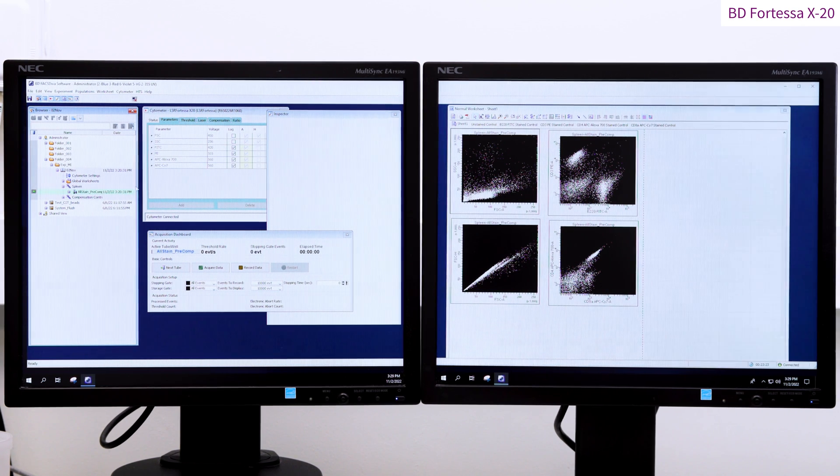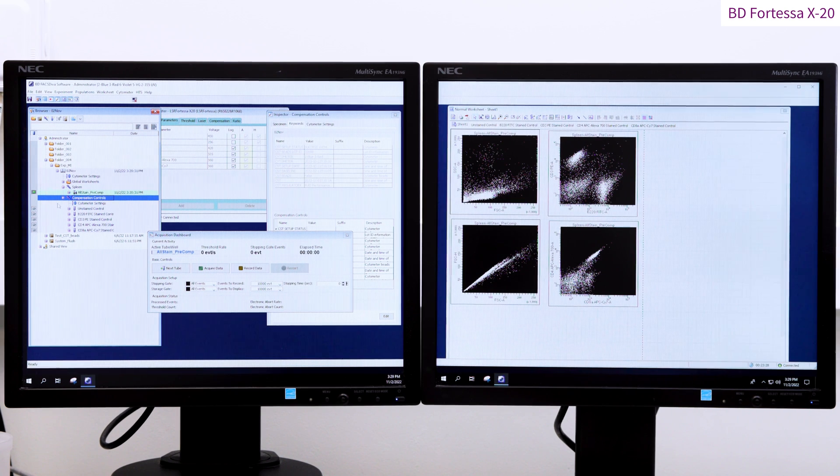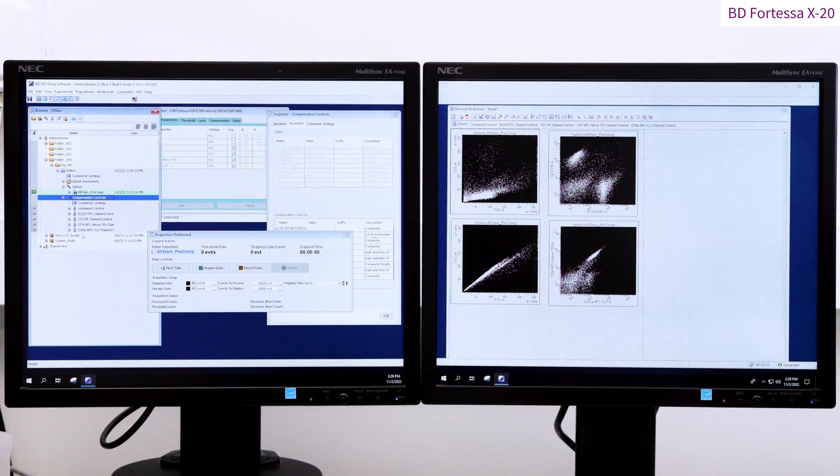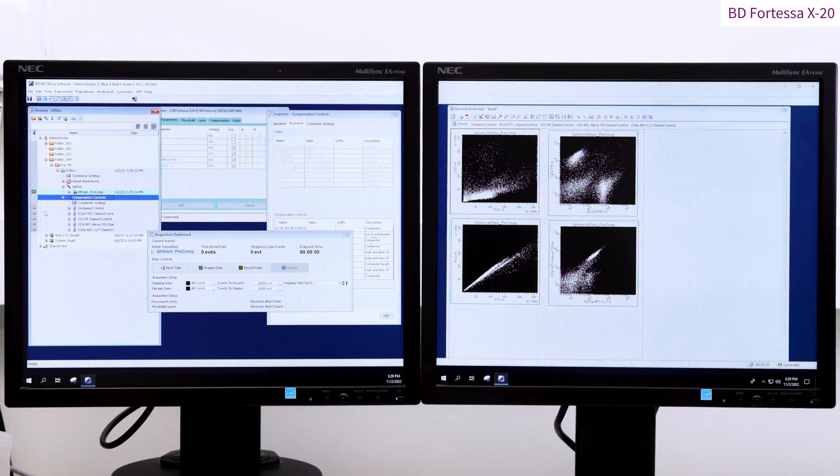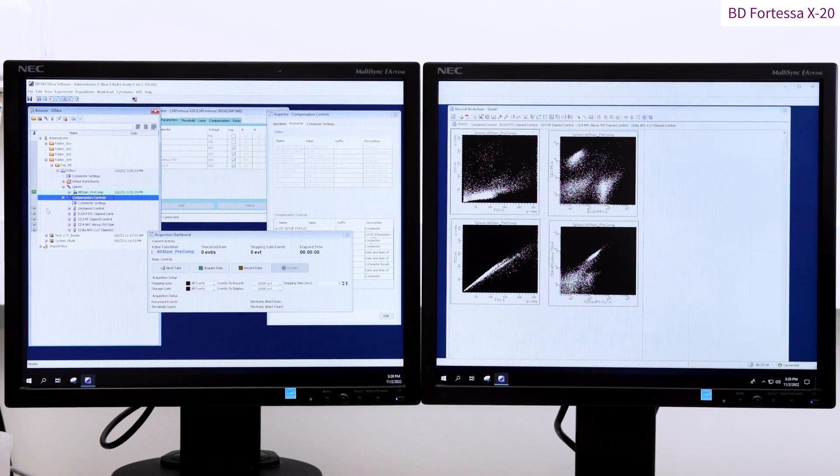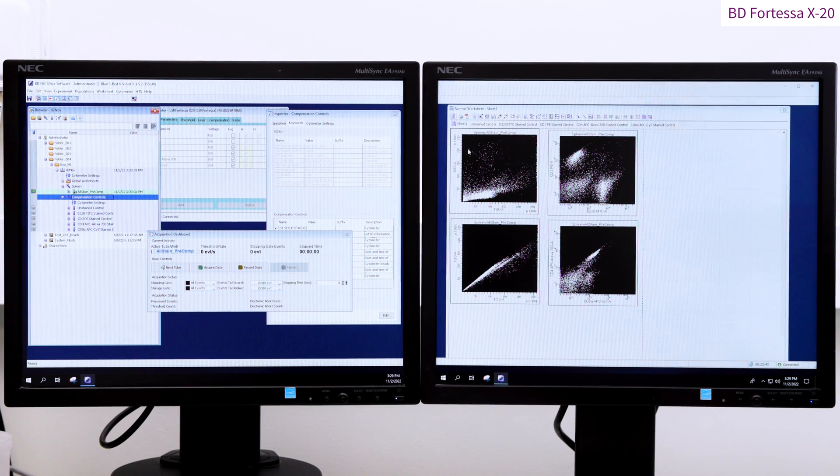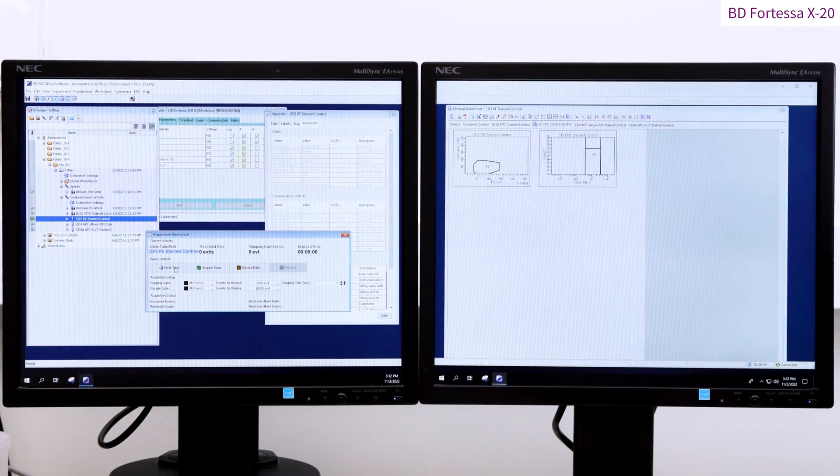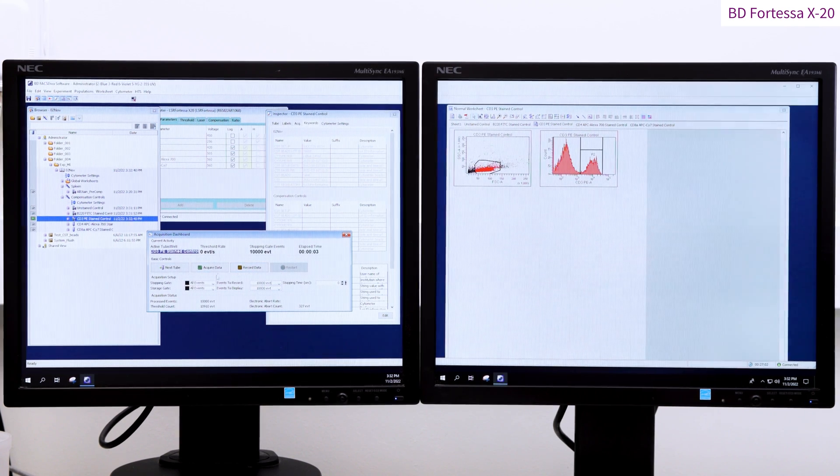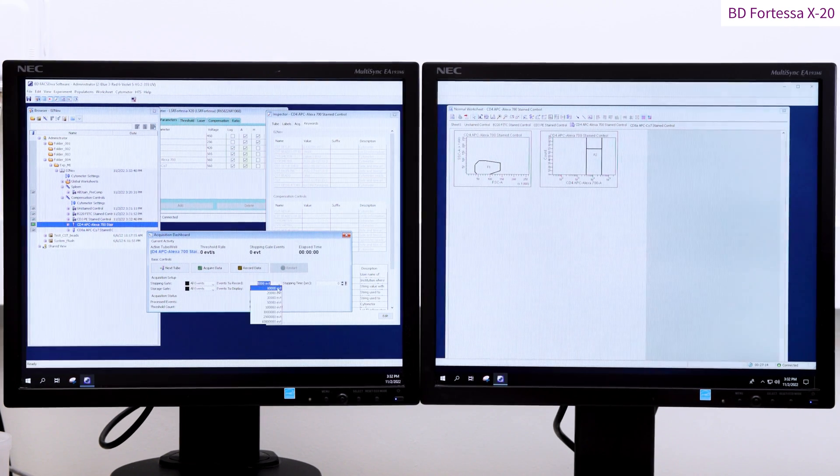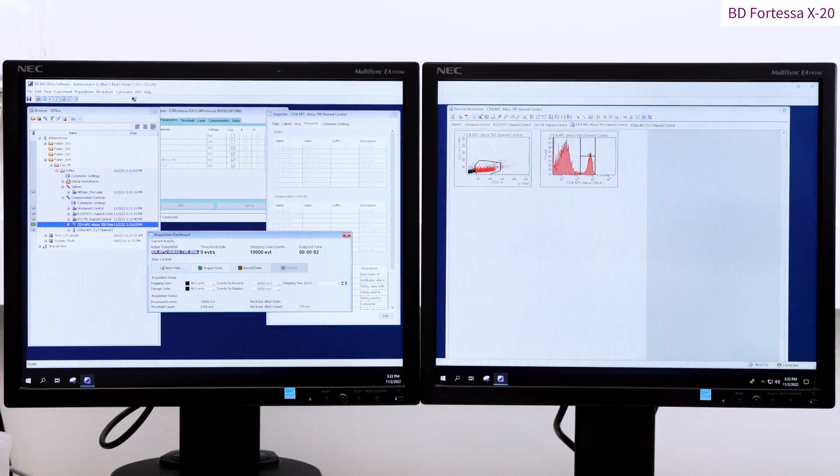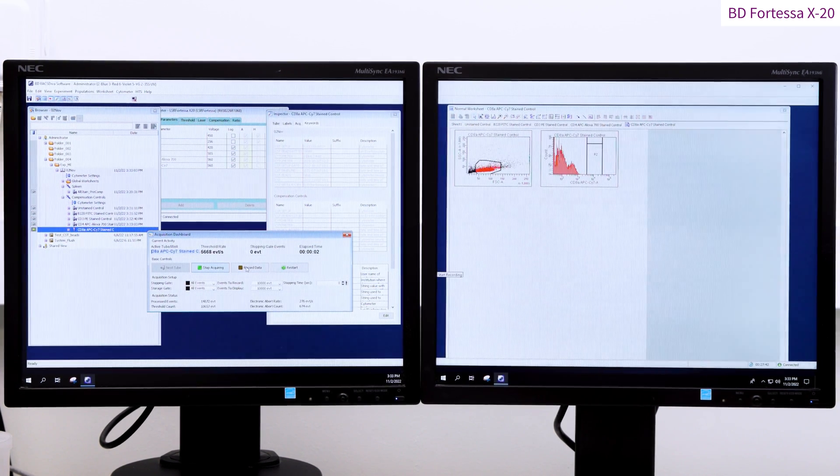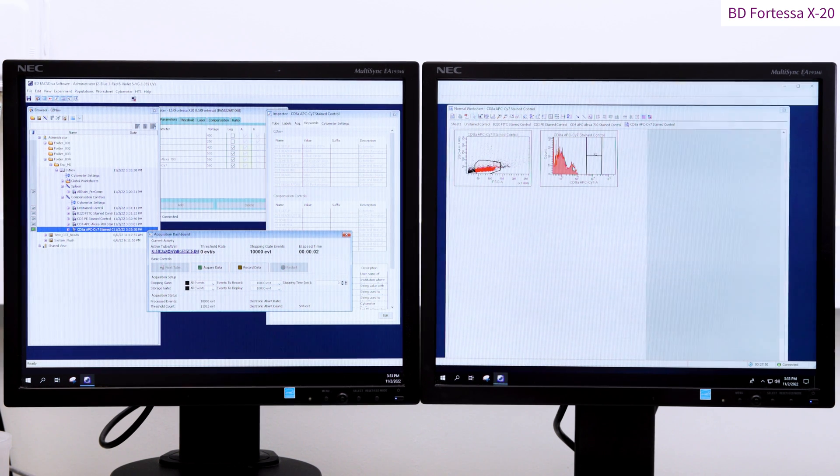While this number of events is sufficient when using compensation beads, it might not suit every single staining made on biological samples. Here we will record 10,000 events. The recording stopping gate is set on all events. This means that every event shown on the dot plot contributes to the recorded event count. The P1 gate is randomly allocated by Diva on the forward and side scatter dot plot. Here I will relocate the P1 gate onto my splenocyte population. By right clicking on the P1 gate, I can assign the same P1 gate to all my single stain samples.